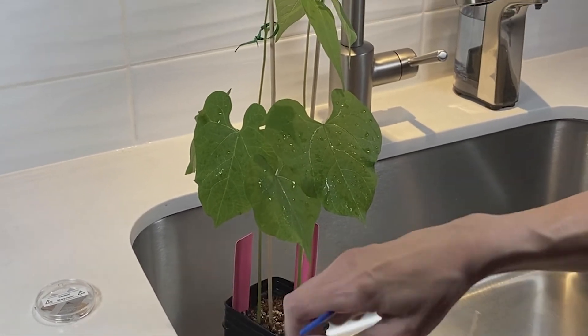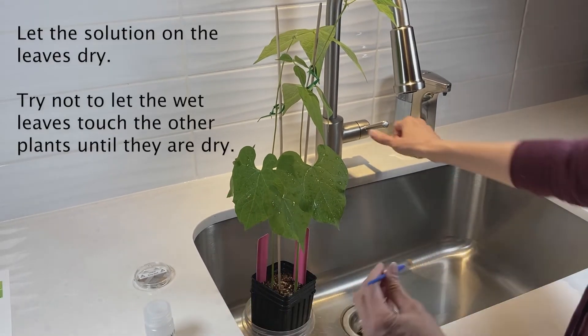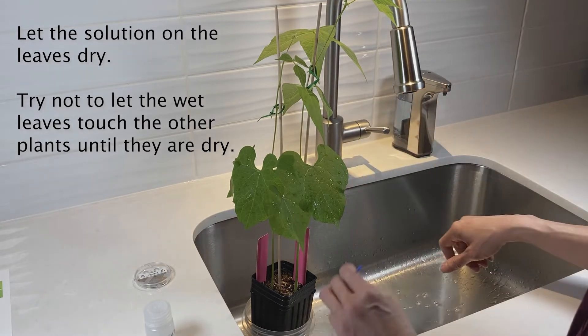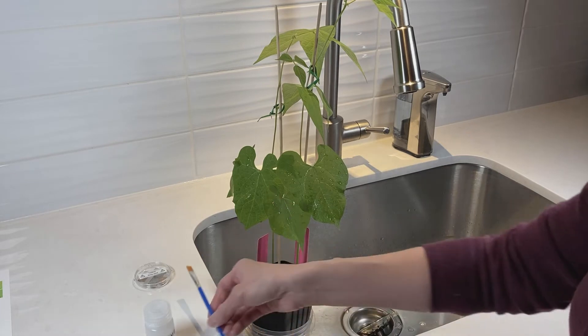And that's all there is to this one. When you are done with your paintbrush, you can just rinse it off with some water and then let it air dry and return it with the kit.